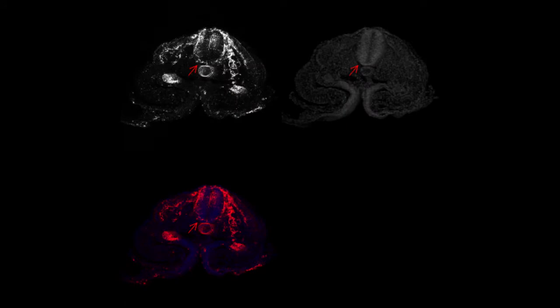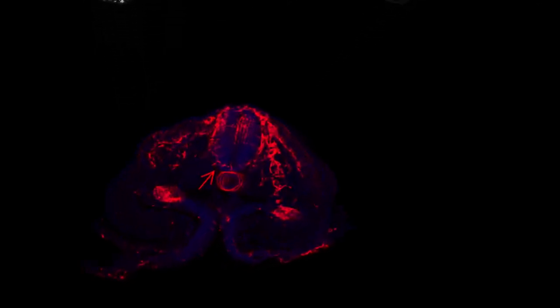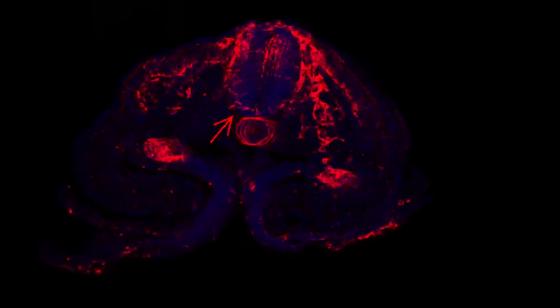This is a maximum intensity projection of a section through the trunk region of a chick embryo taken by Chris Waldheim and Maria Elena de Ballard. If we zoom in on the composite image, the blue is DAPI staining.